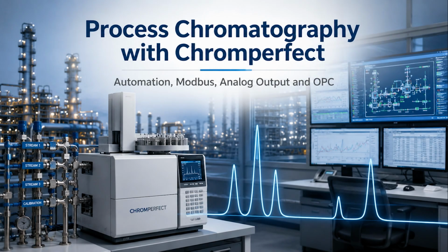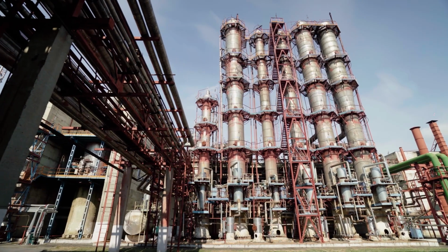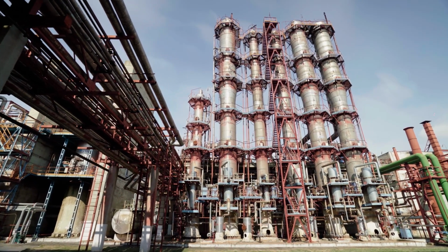Welcome to this introduction to process-focused chromatography with Chromperfect. In many laboratories, chromatography begins with an instrument, a sample, and a result. In a process environment, the situation can be far more complex.